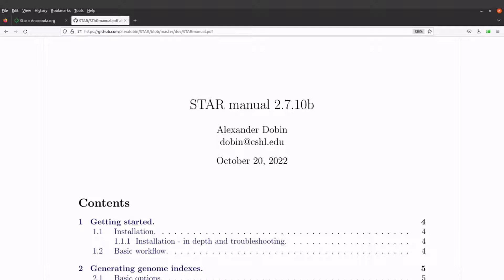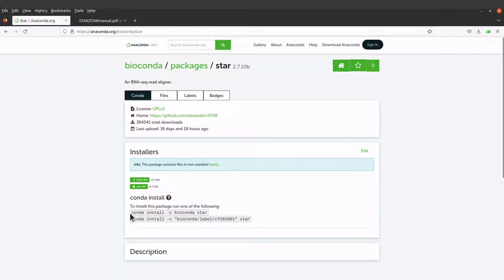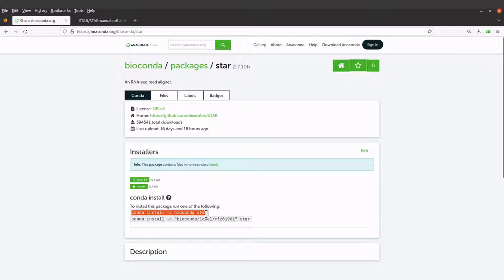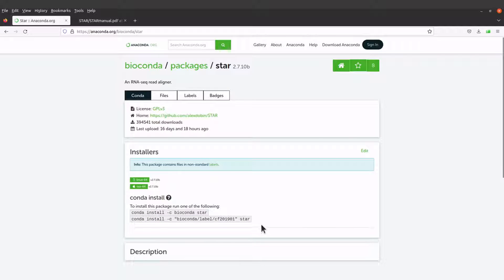So let's proceed. For this video, we are going to use a slightly modified version of this command to install STAR. But you can also use this one to install. Any of these approaches should be fine.